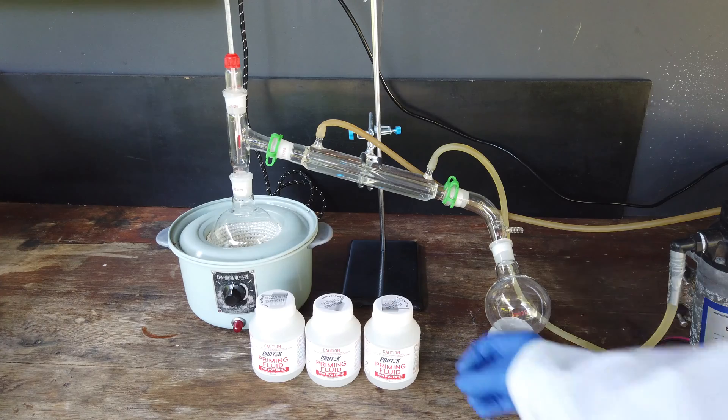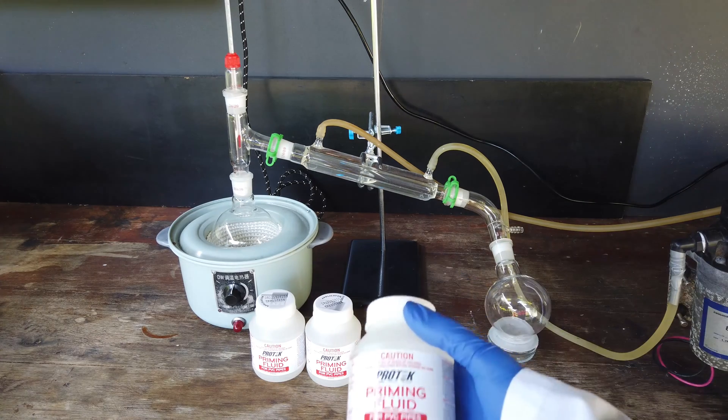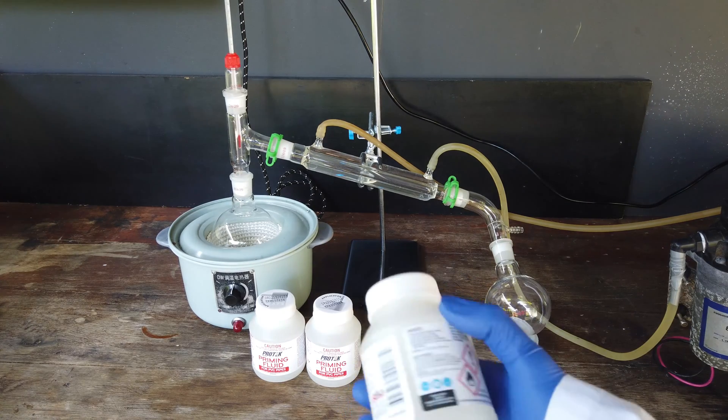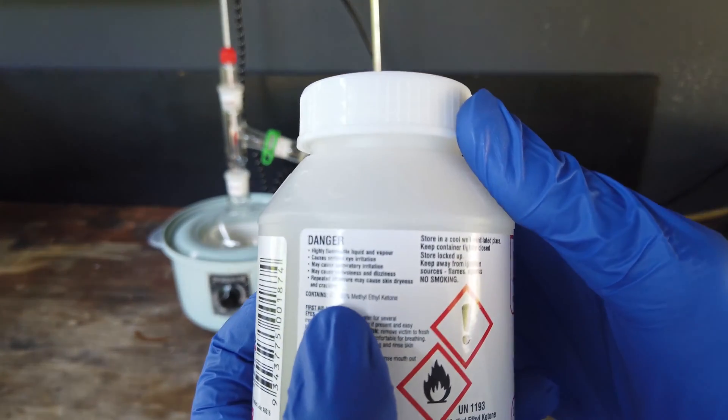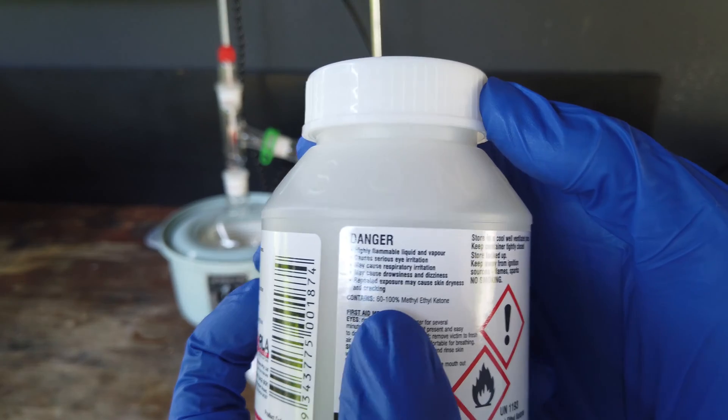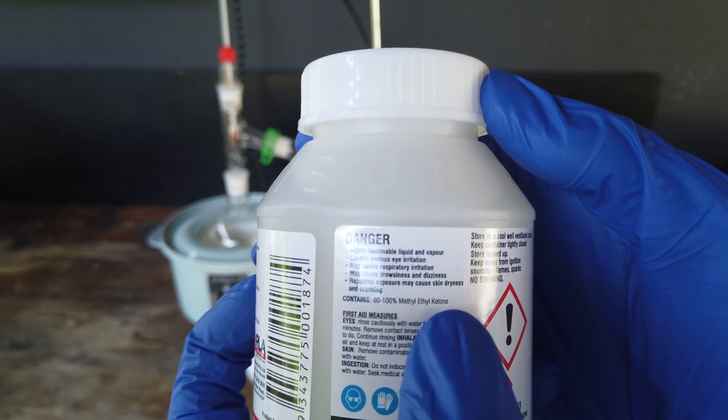Having a bit more of a search around, I was able to find PVC priming fluid, which apparently, according to the label, contains 60 to 100% methyl ethyl ketone.